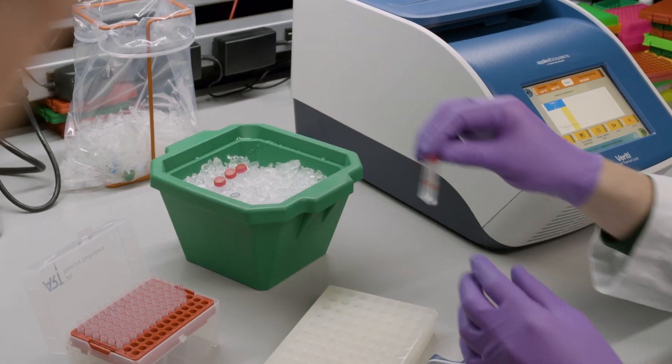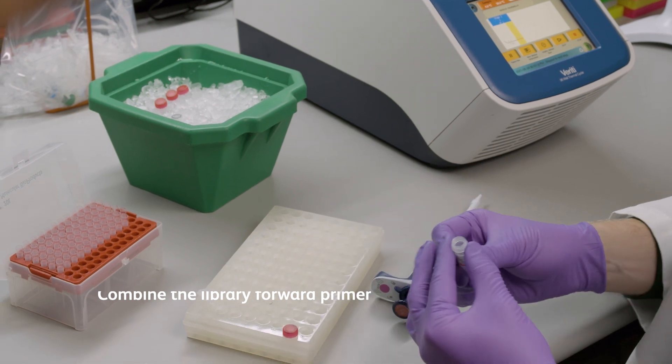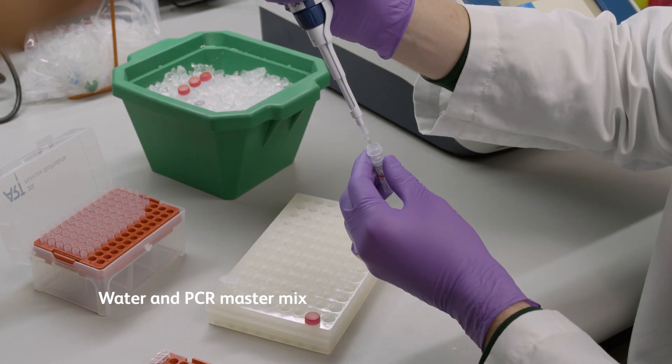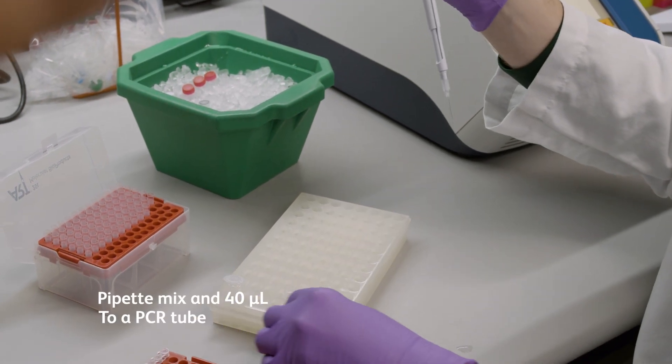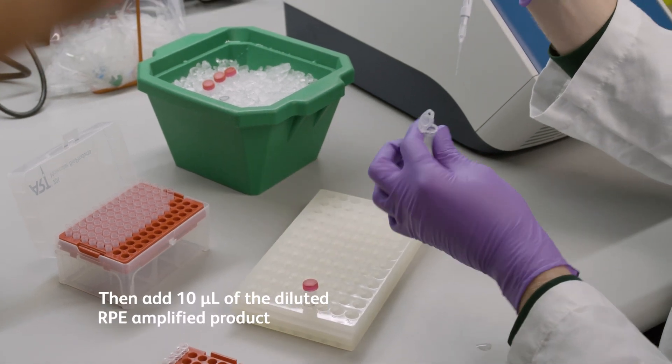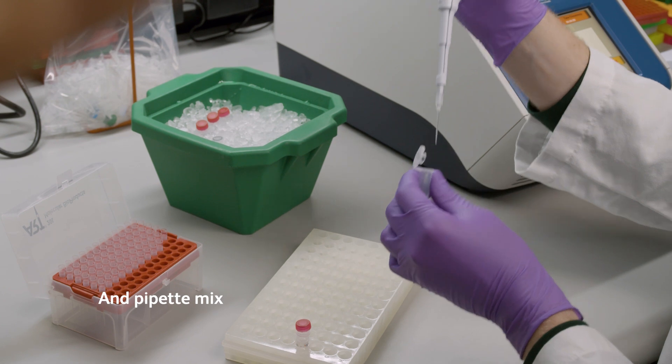Then, make the WTA PCR master mix by combining the library forward primer, one of the four library reverse primers, water, and PCR master mix. Pipette mix and add 40 microliters to a PCR tube. Then, add in the 10 microliters of the diluted RPE amplified product and pipette mix.